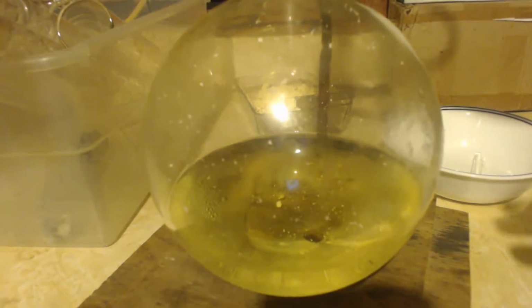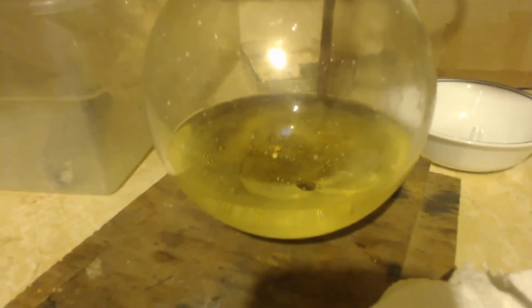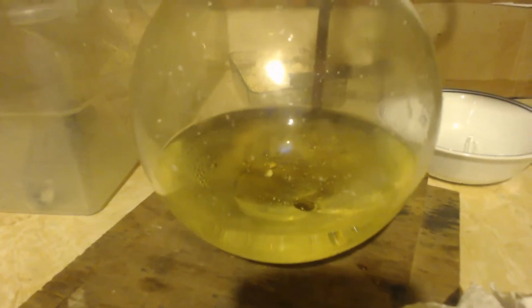Because if you make it more water and less nitric acid, it should be less soluble. We'll see if it helps or not. If not, whatever.